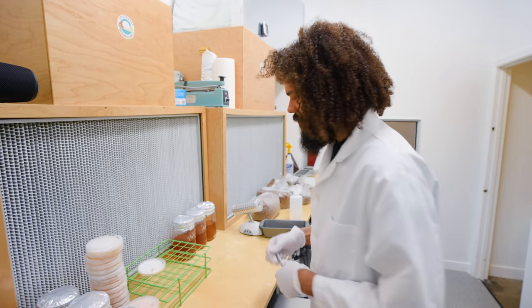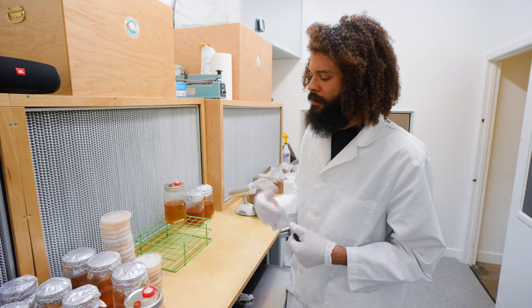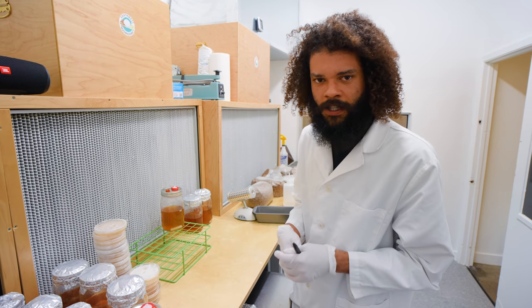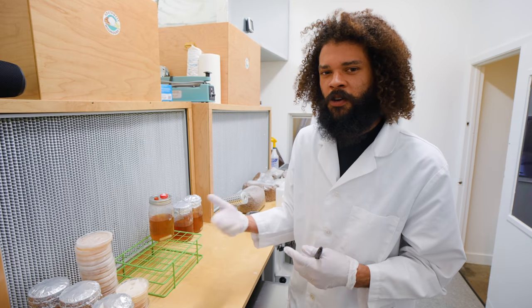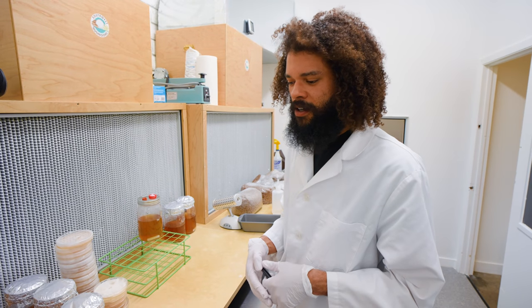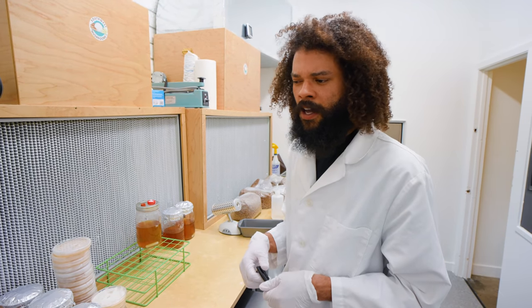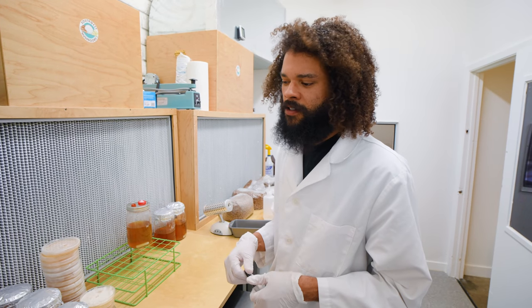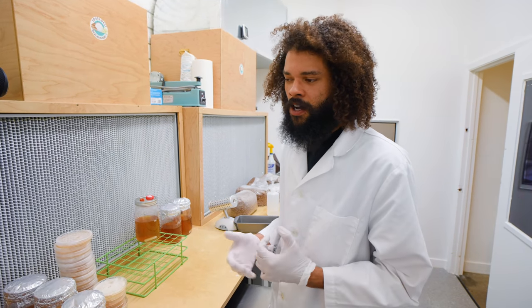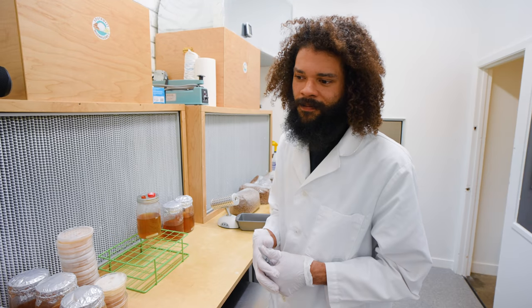Bacteria blooms in a matter of hours compared to the rate mycelium grows, so it's very important to make sure you're not singing during transfers. I've read about a researcher who was singing while working in front of their plates and getting a lot of contamination — once they stopped, the contamination went away. It's really important to know when the right time to talk or breathe is. If you're unsure, just wear a mask until you get the hang of it.